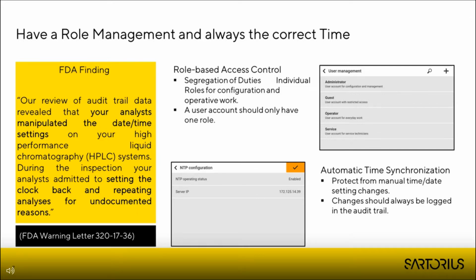So you should also make sure that an administrative user has only administrative rights and not the possibility to perform any analysis. And on the other hand, the laboratory operator or technician has only the rights to perform analysis, but not rights for making changes on the system.